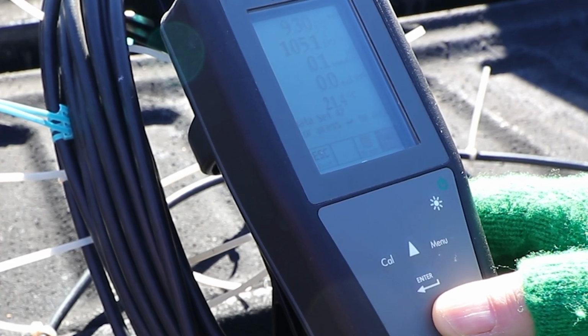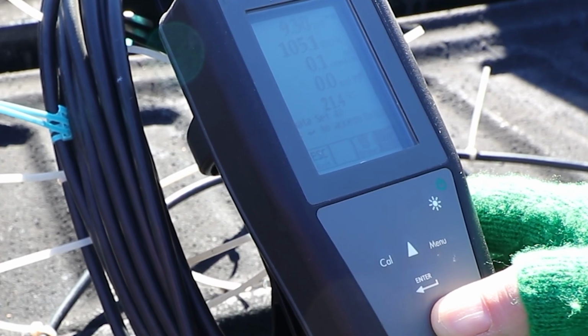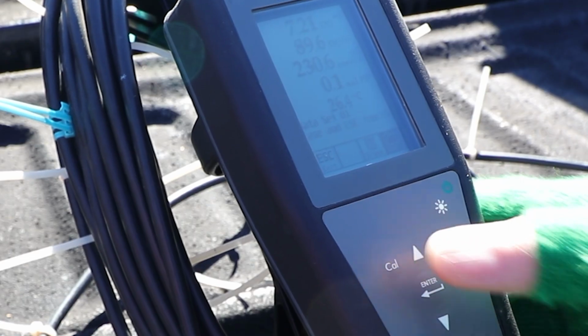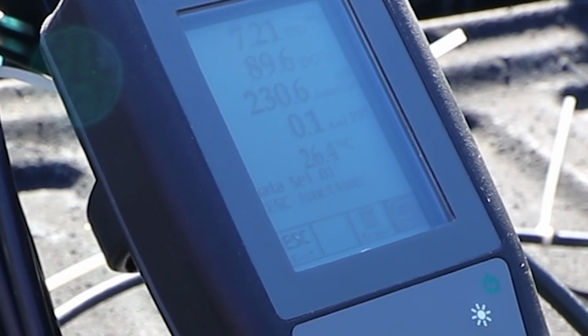To go down to the next most recently saved data set, you press down. In this case, you'll see dataset 46. Or if we wanted to go all the way back to the beginning, we would press the up button, and that would take us to dataset 1.